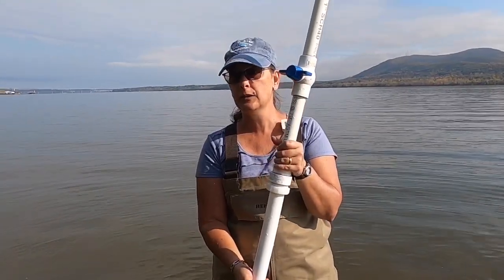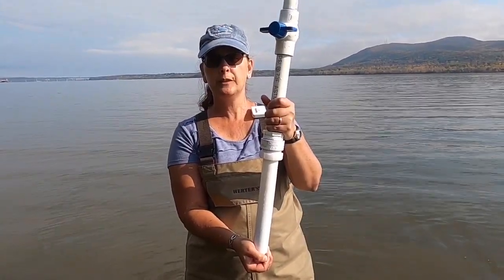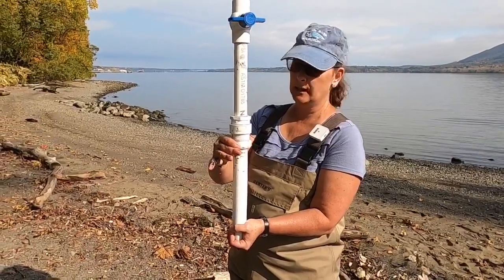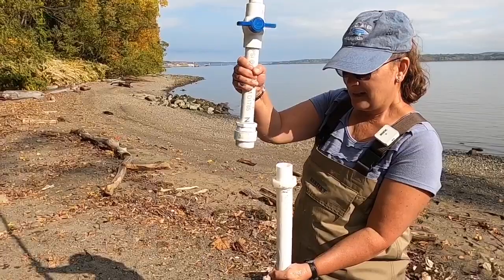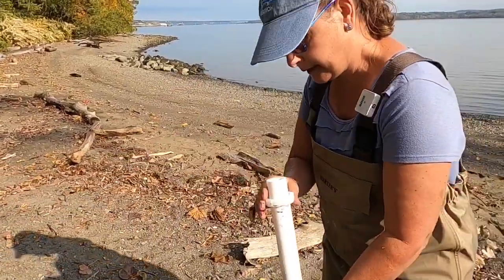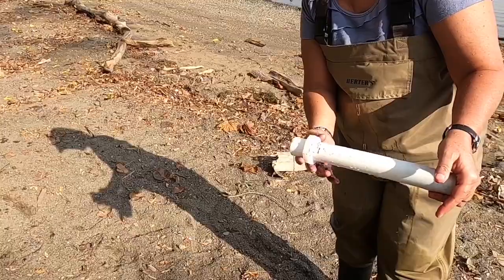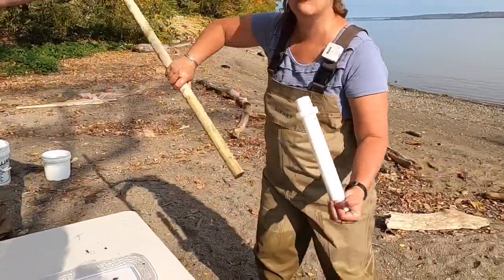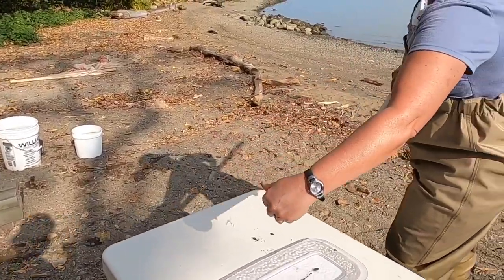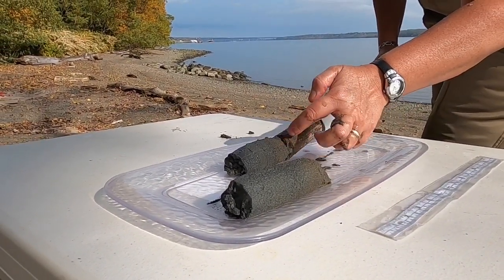Now we're going to go over to the table and unscrew this area here. This part of the pipe is going to come down and we'll be able to check the sample. Once we get it out of the water, we unscrew this particular piece and pull up on the tube on top. It does hold a little water from where the ball valve was, so it can get a little messy. I'll pour the excess water out, then use this dowel. I've already taken one sample out, so I'm going to push the second sample out right now through the tube. We've got our second sample.